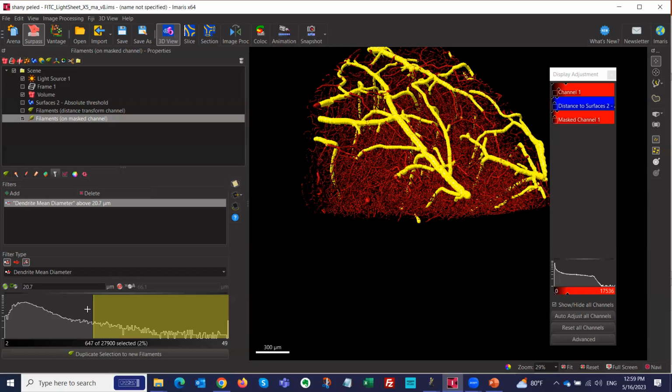What I mean by this is you create it once, like we did together, then you open a second image, and you apply the same filament machine learning trace that we've done, and then go step by step. It will import the machine learning automatically. You don't have to redo it, but you can refine it. So you go to the machine learning step and see, hey, it didn't work that well, just refine it, and then you do it on another one, and once you get a feel that it works very well with the 5 data sets, then you can blindly apply it on the others. So you don't have to do it again.